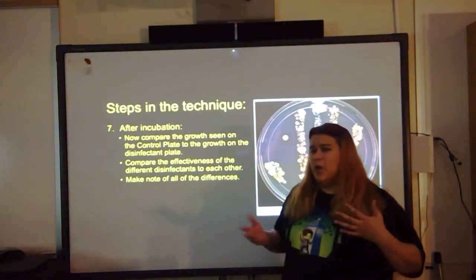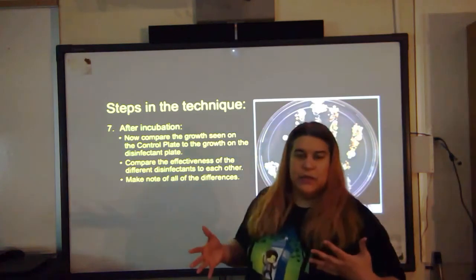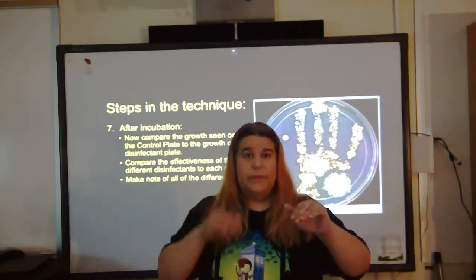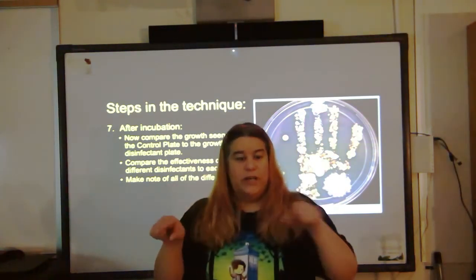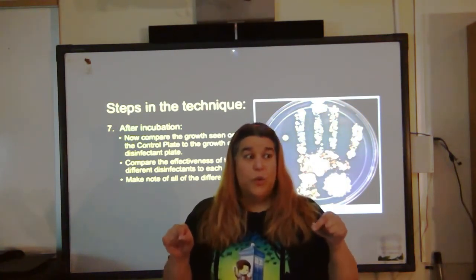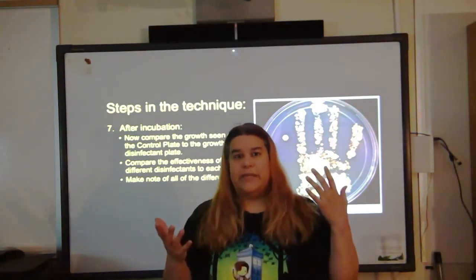You also kind of want to compare the effectiveness of the different things. Look at the 10 seconds with the soap, the hand sanitizer, the alcohol, the hydrogen peroxide. Compare those. Which one looks the best? Which one has the least amount of growth for using it for 10 whole seconds?